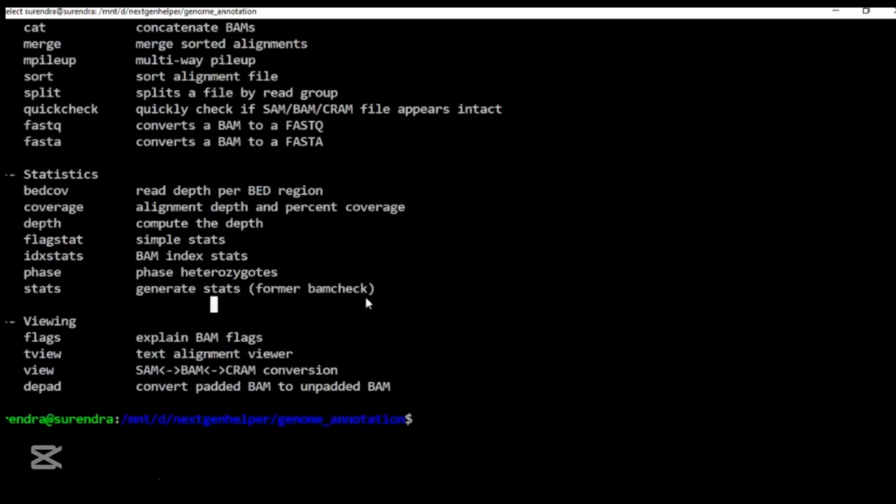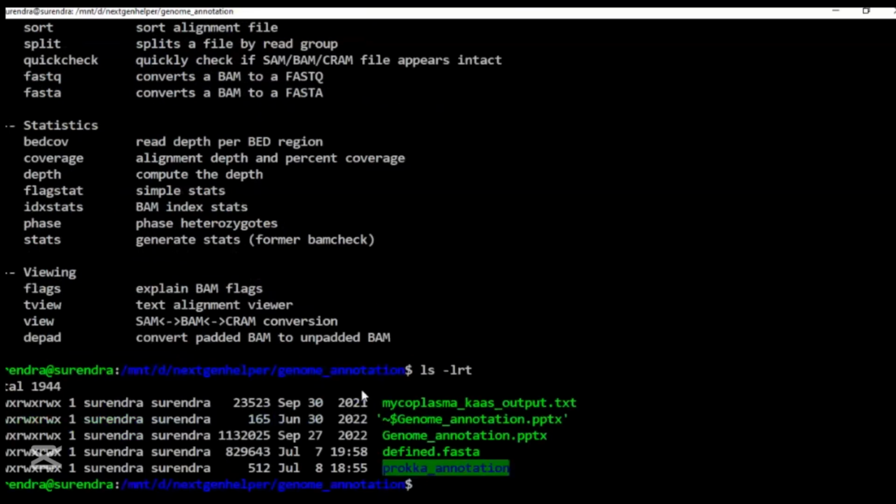Anyway, so once we have the consensus sequences, as we analyzed yesterday, those two assemblies, the refined and the default one, I found that the refined assembly was better than the default parameter k-mer-based assembly. So I selected this one here for the annotation using Prokka, and we will also upload this to the server. To do the Prokka annotation, we can use here, sorry.